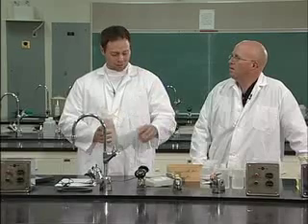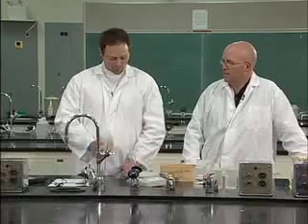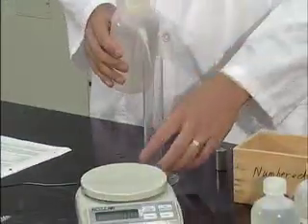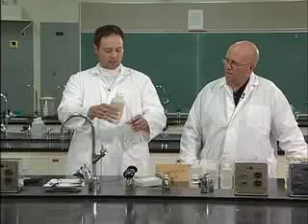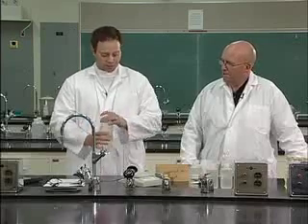Okay, do not use your glass graduated cylinders out of your drawer for this, because they will shatter and break. What you want to do is fill up your graduated cylinder with the distilled water. As you can see, if I did it this way, it would probably take me 15 or 20 minutes to squeeze out enough water to fill it up to 70 milliliters. You want to fill it to 70 milliliters.